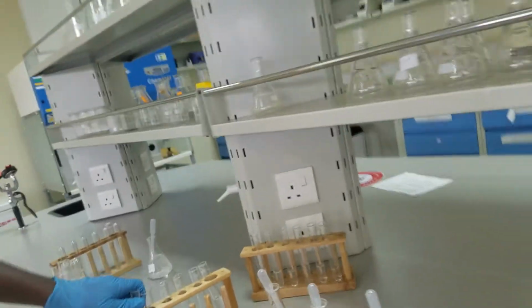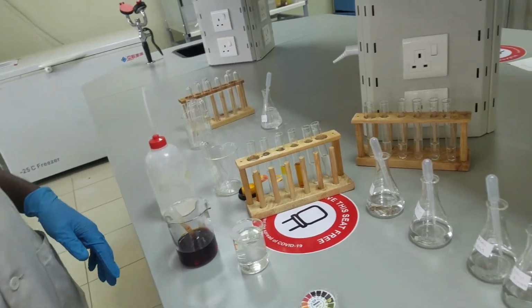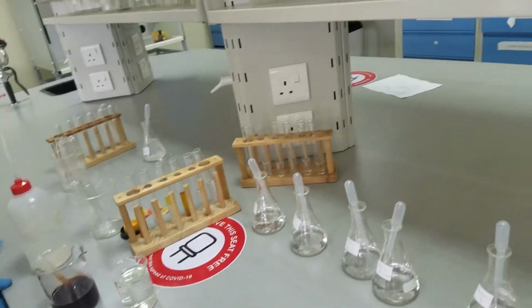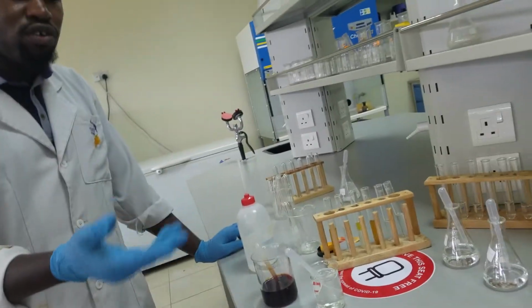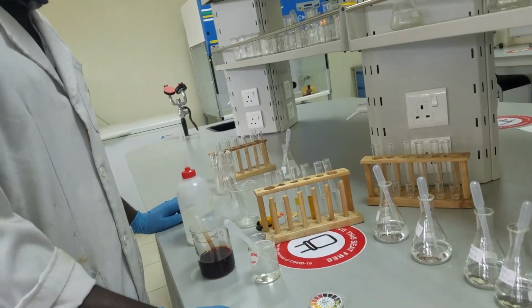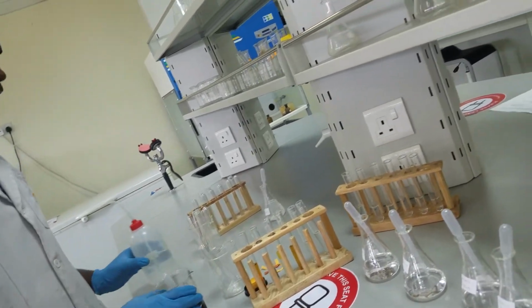Okay, so from that, maybe you have been able to do some identification with the iodoform test, but we just want to maybe do further tests so that you can confirm that whatever unknown you have in mind is actually correct. So I'll do the last part of this practical, which is the bicarbonate test, for our last identification.